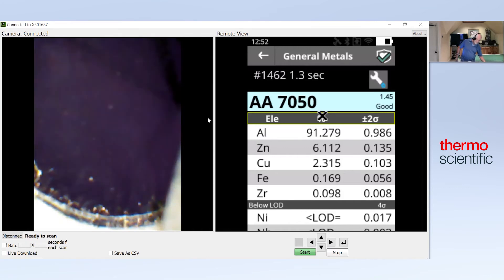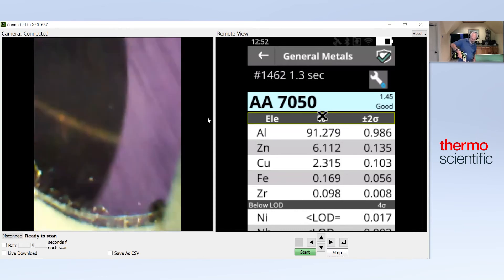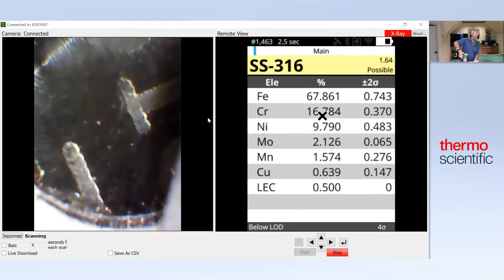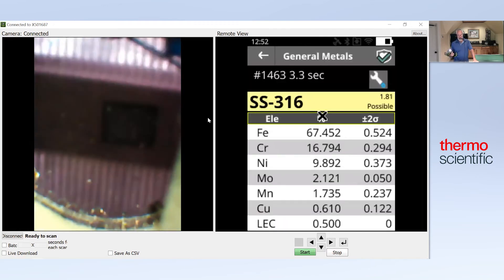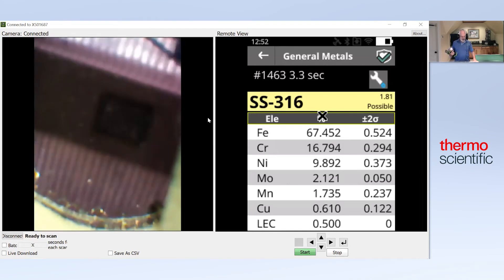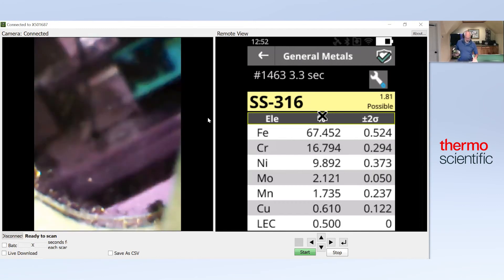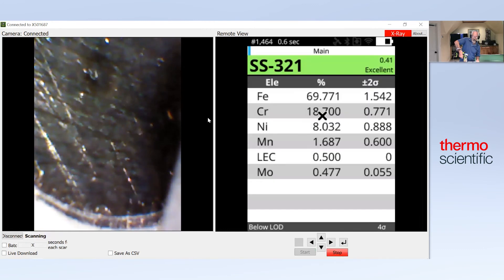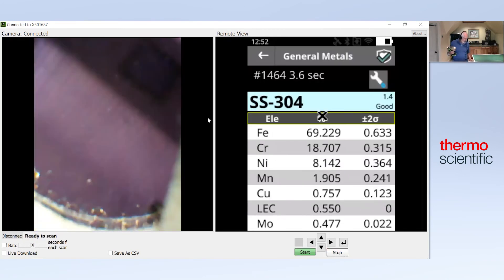Let's go to some money making alloys like 316 and 304. These are two of the most popular stainless steels in the world. They're both considered to be like an 18-8 chemistry, although the 316 has a little higher nickel. Instead of 18 chrome, 8 nickel, it's got about 17 chrome, almost 10 nickel. But the big difference between that and the 18-8 304 is the molybdenum, which is 2%. Take a look at the 304 when I shoot this one. And what you'll see is it does come up with the typical 18-8 chemistry, but molybdenum is very low. And that's how we know the difference.